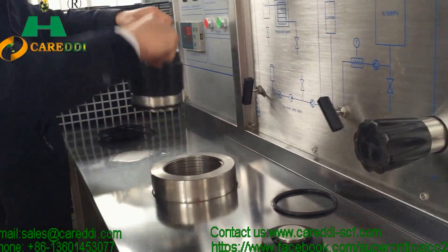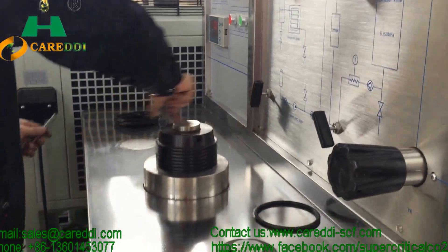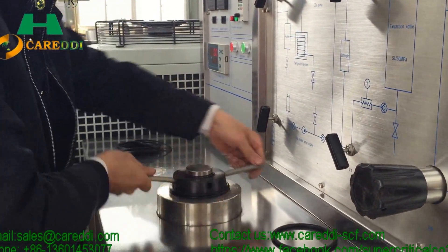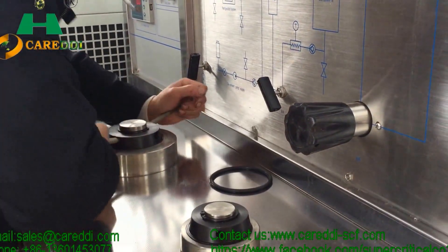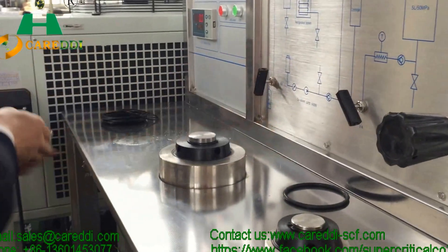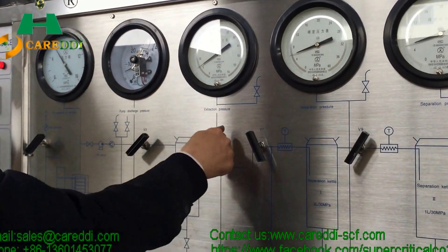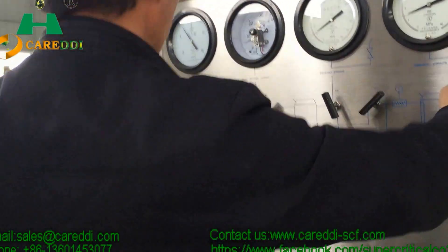Now we put in the gasket and tighten the cover using special metal tools to make it safe before the extraction operation. The engineer is setting the temperature and pressure when the machine starts, and adjusting all kinds of valves to control pressure and temperature.